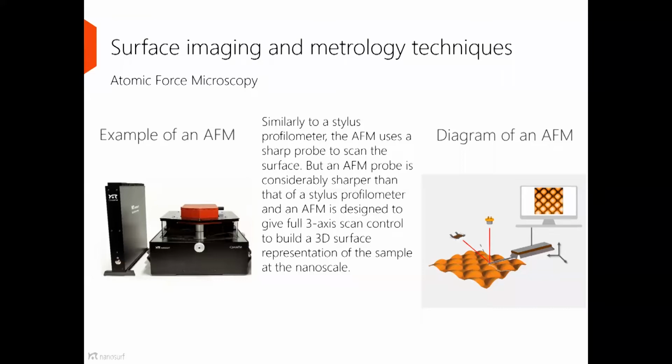And we're going to sense the surface by doing something that's called optical beam deflection. Almost every AFM on the market will take a laser. It will bounce that laser off the back side of our cantilever and put that reflection onto a 4-quadrant photodetector. And so any perturbation of that cantilever in any direction is going to be sensed by a change in the location of the spot on that 4-quadrant detector.